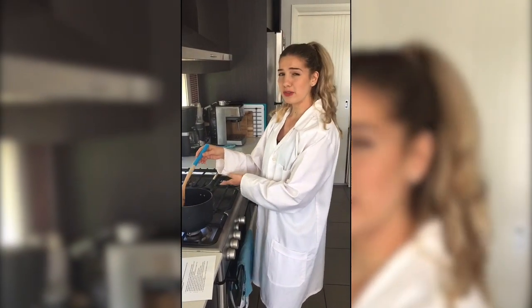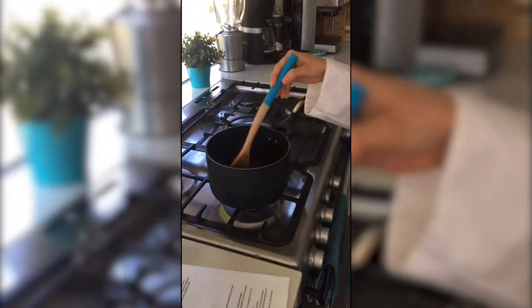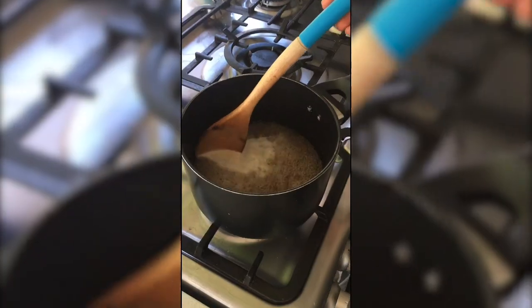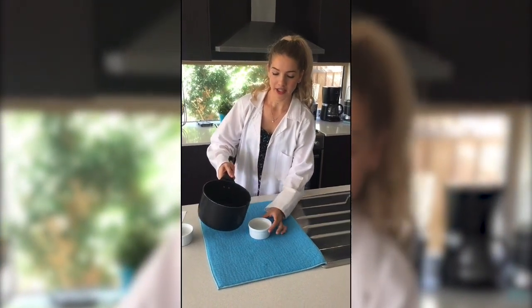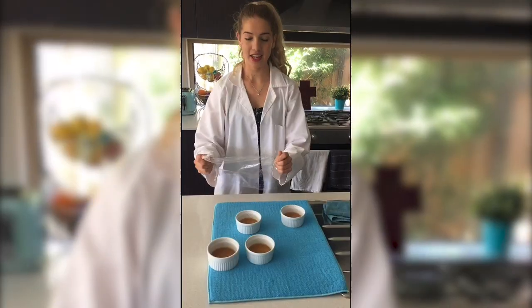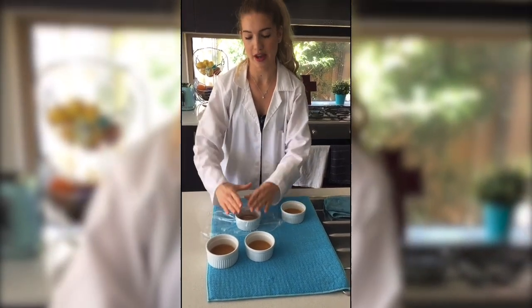Heat the saucepan on medium to low heat while continuously stirring. Heat until it boils and then let cool for 3 to 5 minutes. Pour the mixture into a petri dish, filling it up one third.